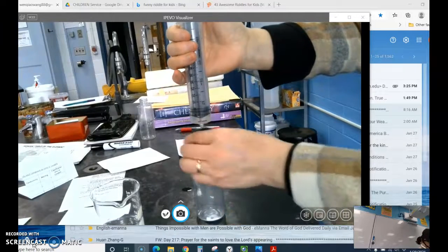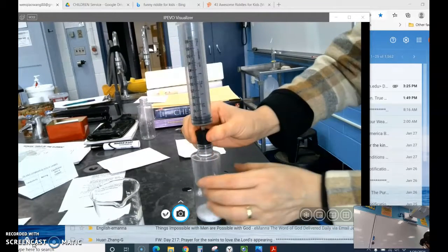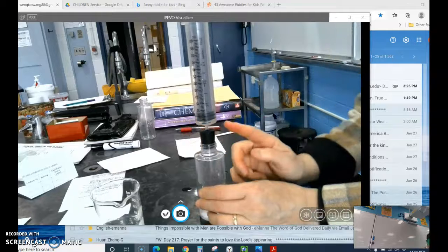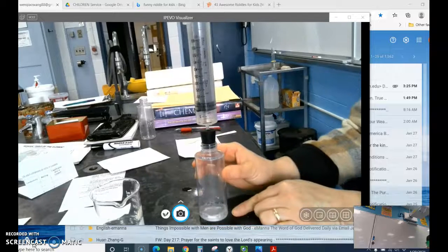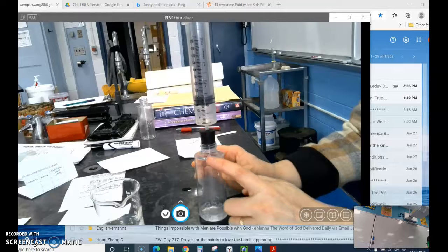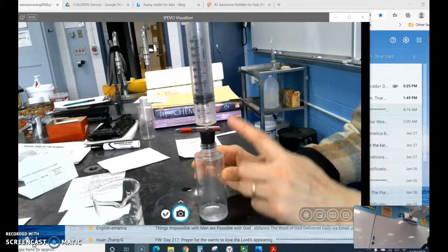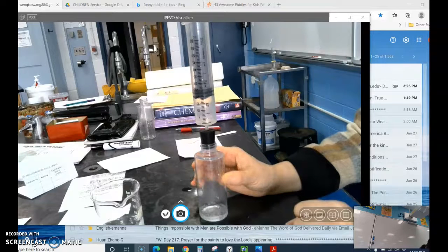So I'm going to push this one in, and then seal this carefully. I hope you see the rising of the plunger. The rising is caused by the carbon dioxide produced in the reaction. Since this part is sealed, they have no other place to go but rising here. Okay. So when this one stops, I will bring this one closer, and then you can record how many milliliter of carbon dioxide produced. So right now, it seems like it's still rising, but very slowly.